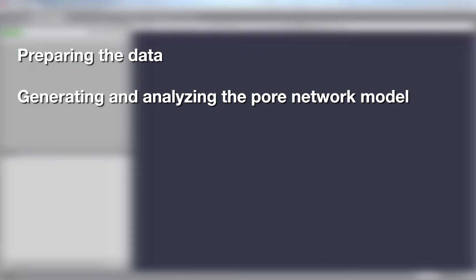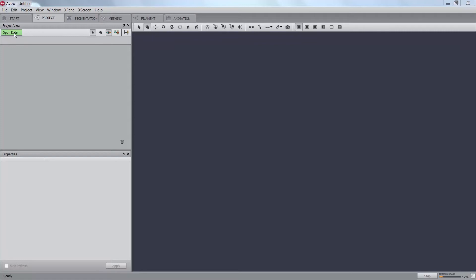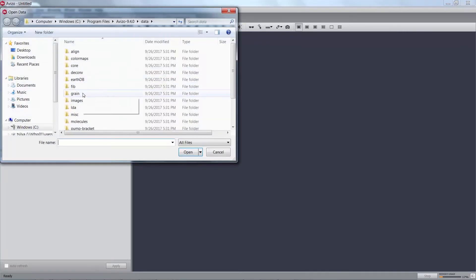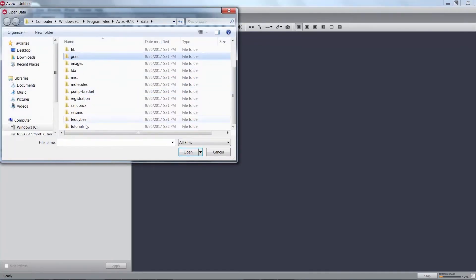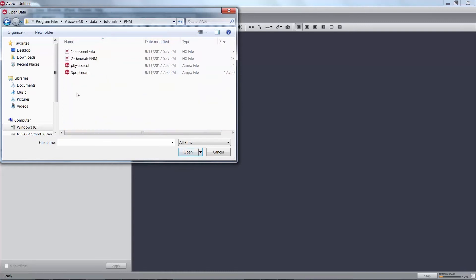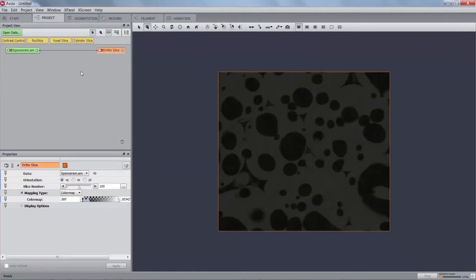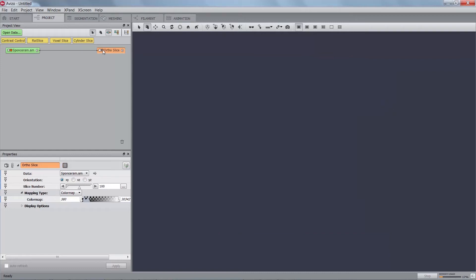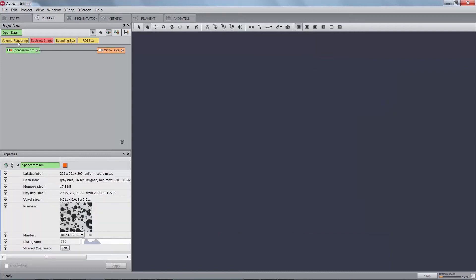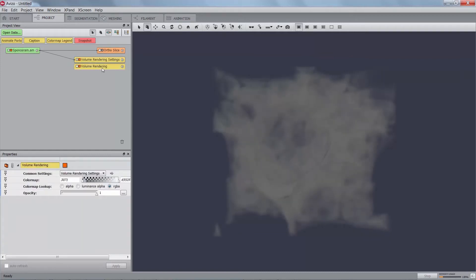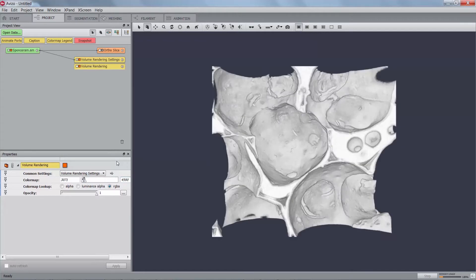In the first section, we will prepare the data to separate the void and the solid phase of the ceramic. Load the file data.tutorials.pnm.Sponceram.am and display it using the volume rendering module. Set the color map port max to 4590 to have a better rendering.